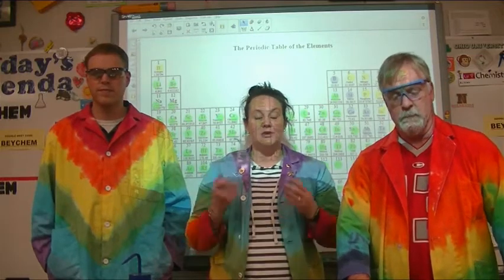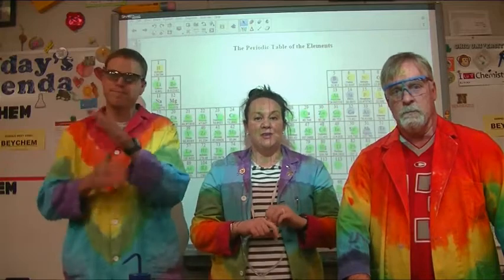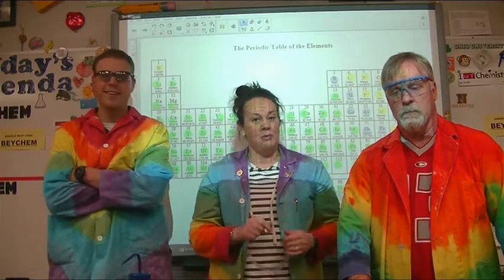Going to today, guys, we are going to do a little demonstration for you. It's called the Reactive Metals series. We are going to take some of the alkali metals and chuck them into water and see how they play. So we are trying to drive home the trend 4 in our notes from Monday, which is the reactivity series. Let's refresh that really quickly.